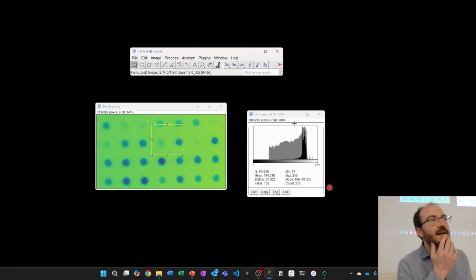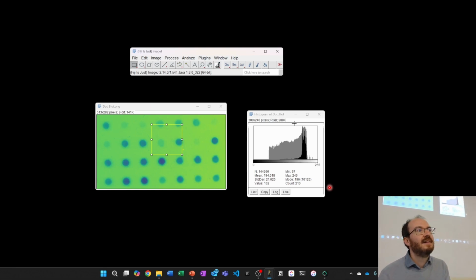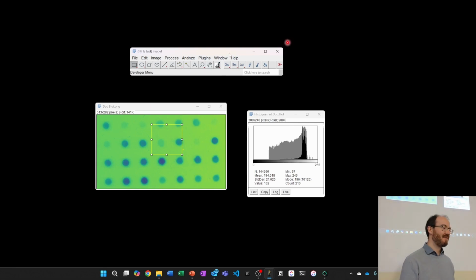So I was fighting with Fiji when you were explaining the stuff about GFP. What I was explaining is that when you take images on the fluorescence microscope, you get a certain intensity out depending on what your dye is. That could actually be some color, with some variation in red, green, and blue. It's not just a fixed color. But what you want to do is extract just a single grayscale value from your image. Now you've got different structures labeled with different fluorescent proteins, and you want to keep track in your mind of what is what and how to go about this.